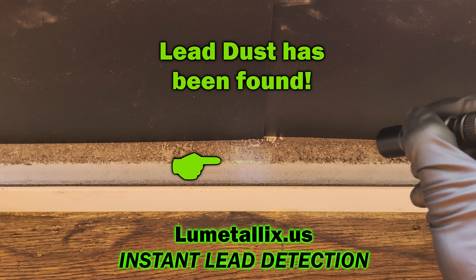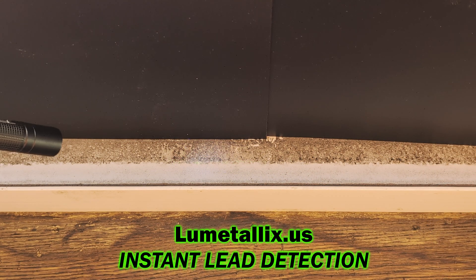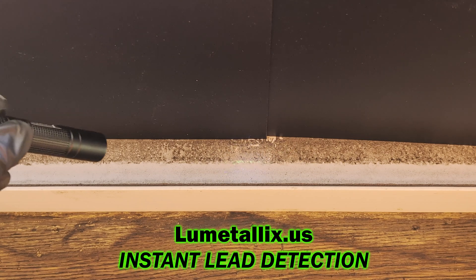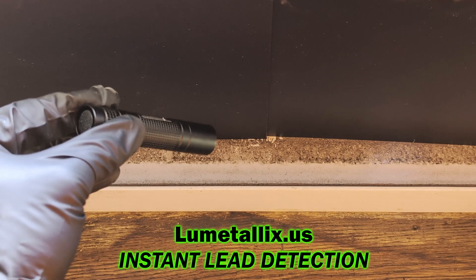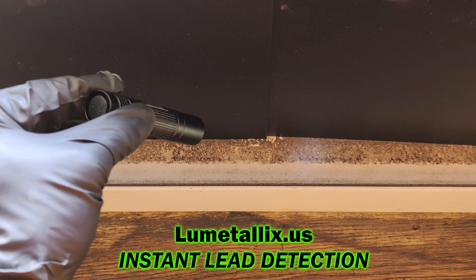Here's where I found some lead dust. When sprayed, or using the drip tip bottle, the Lumetallix reagent reacts to the lead dust — it glows green.